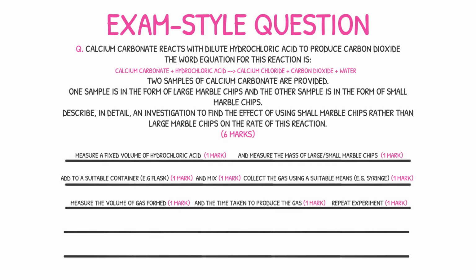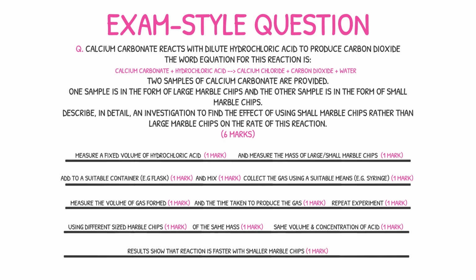Then repeat the experiment. However, this time, use the other size of marble chips, ensuring they are of the same mass, and that the volume and concentration of the acid are the same too. Your results should show that the reaction is faster with the smaller marble chips.